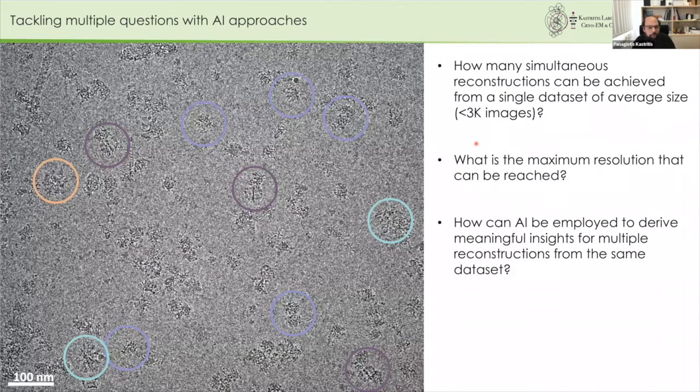Moving on from this molecule, what I want to show you here is how, together with our collaborators at EMBL Hamburg, Gregor Czonowski, we developed a protocol to try to understand more structures from cell extracts.